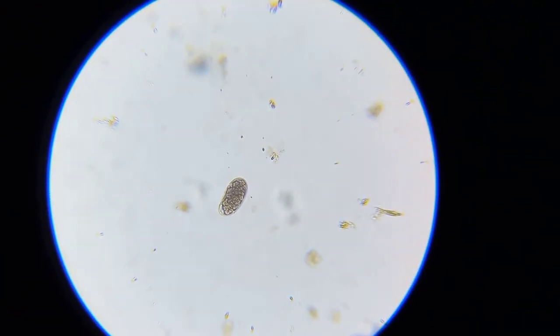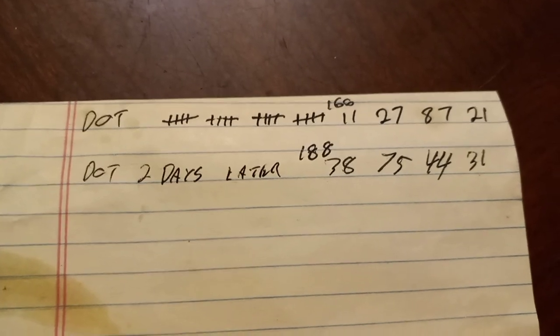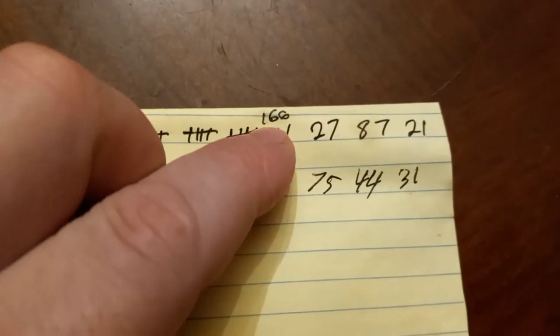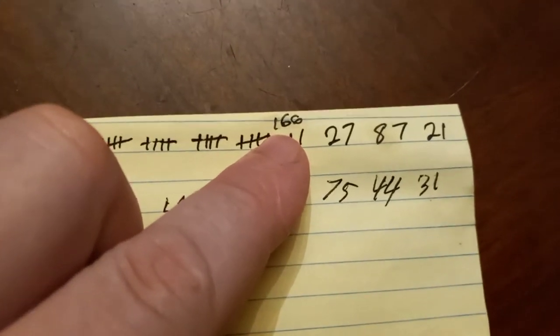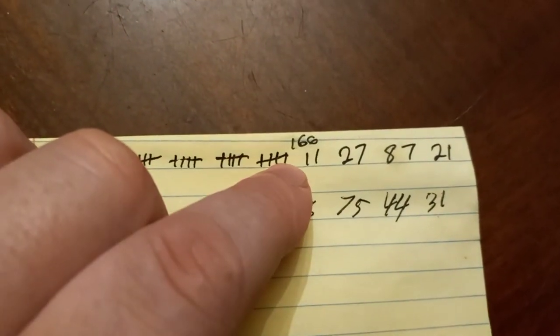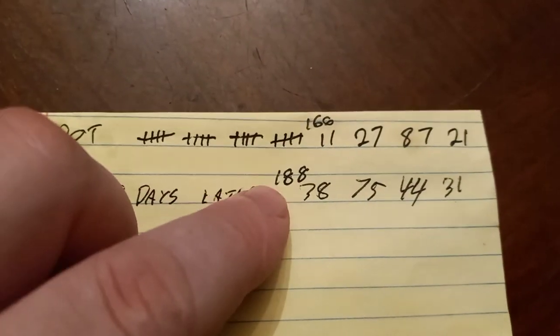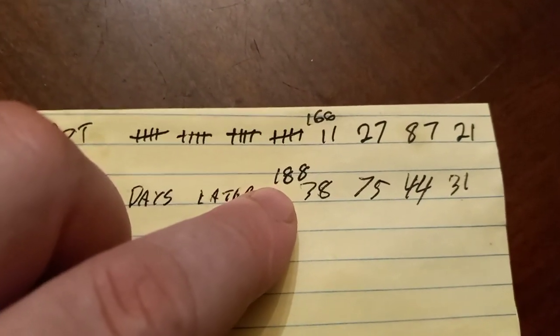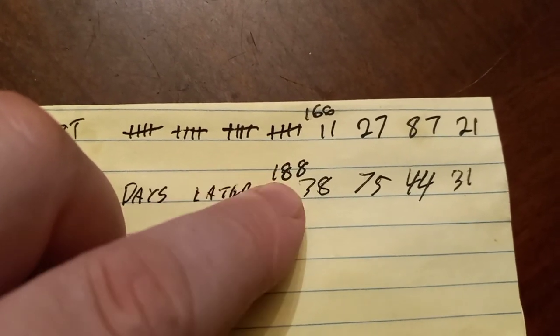I did a little worm count here. Just before we wormed her I had 166 worms that I could see on the slide, though I don't have the grid slide so the number could be off. And this is today — after worming, I think it's been about two days since I wormed her. So 188. I would say there's basically no change.